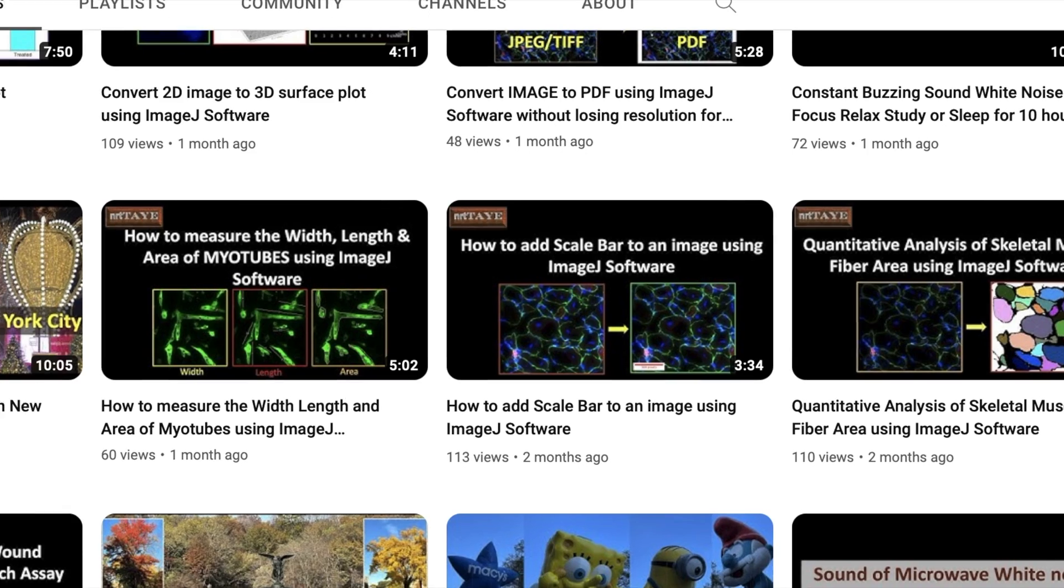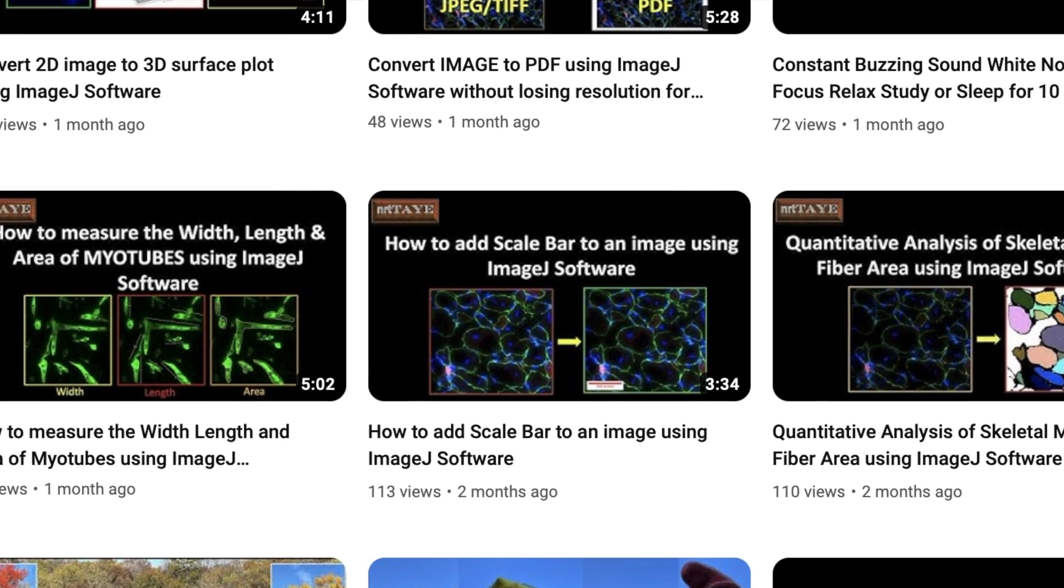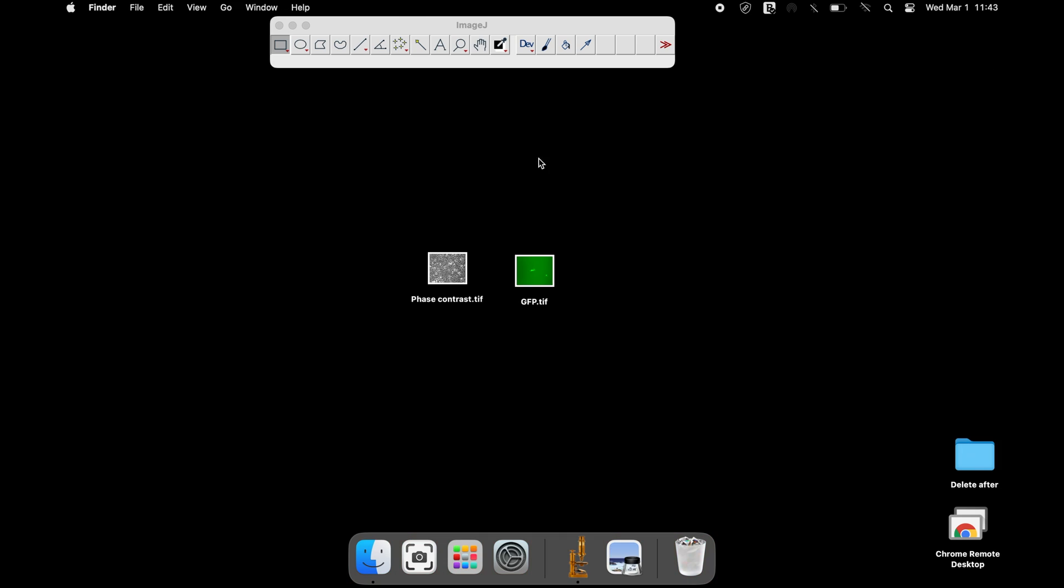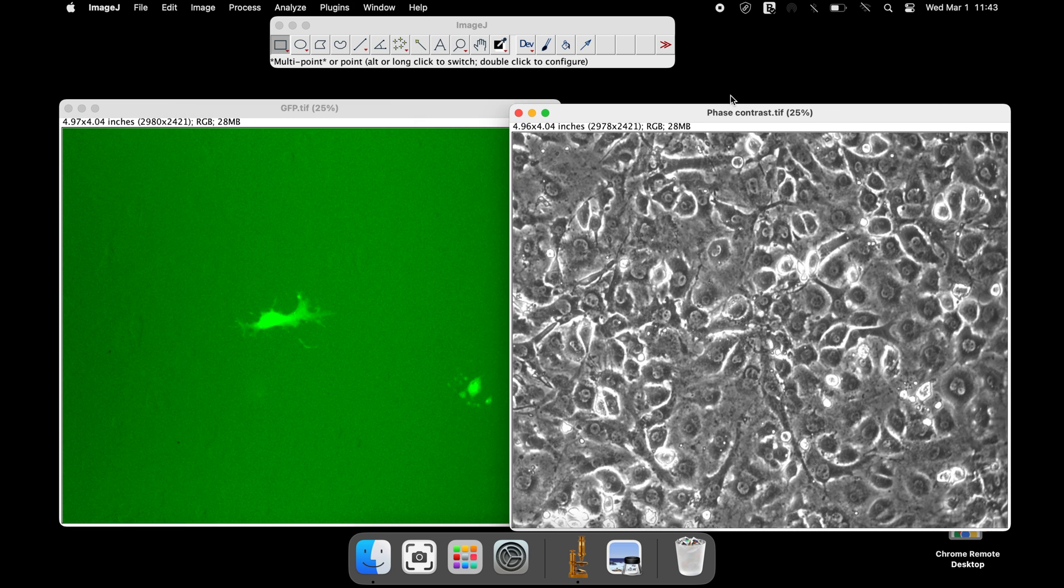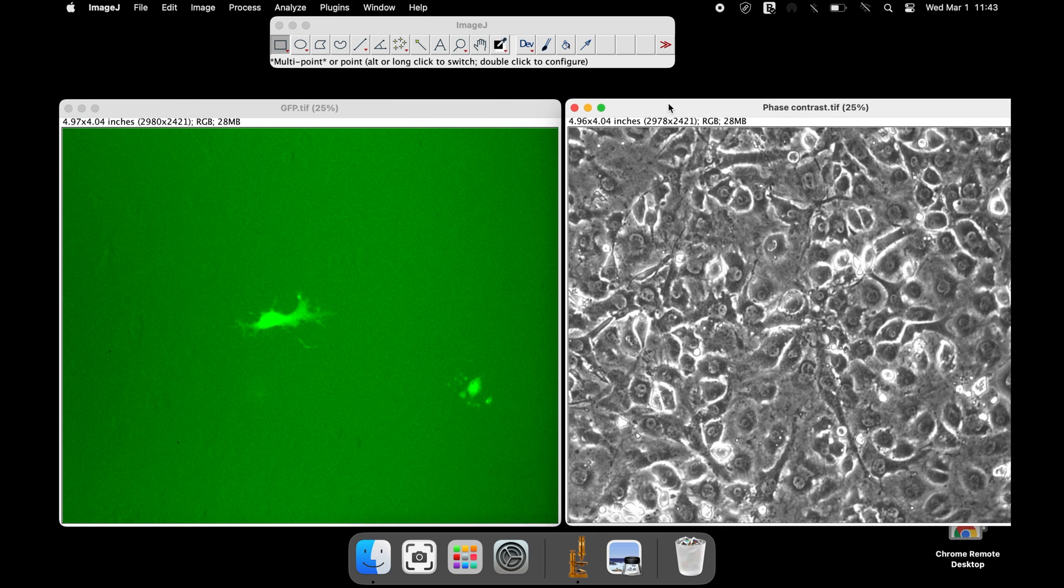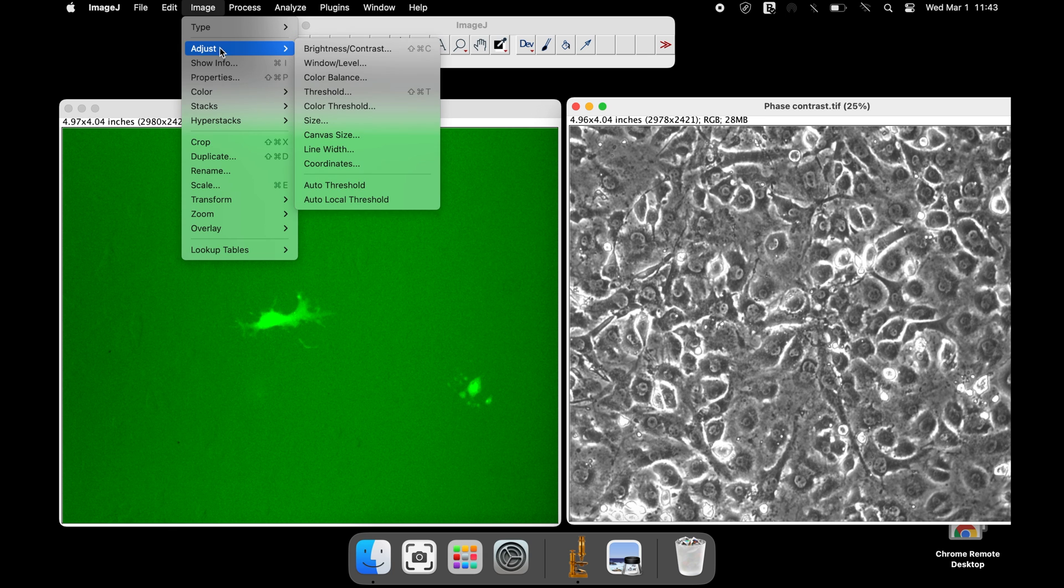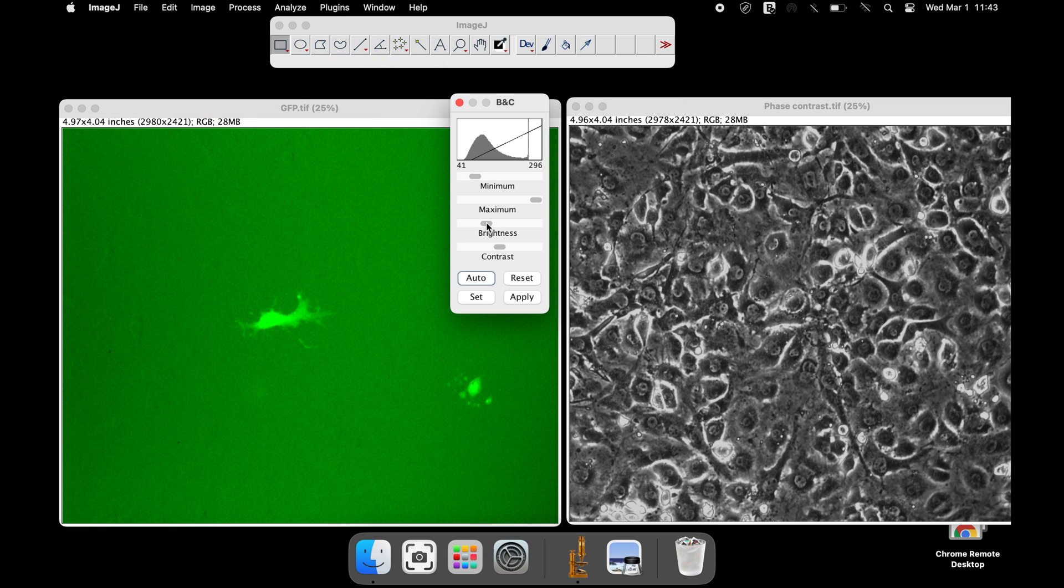To merge images of different channel colors, open all the images using the ImageJ software. If you would like to modify the image contrast or brightness, adjust the modifications before performing the merge.